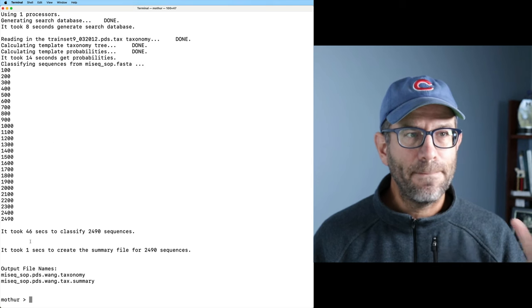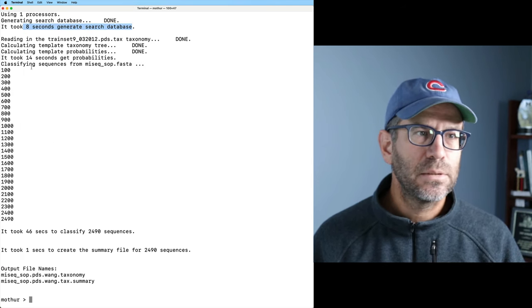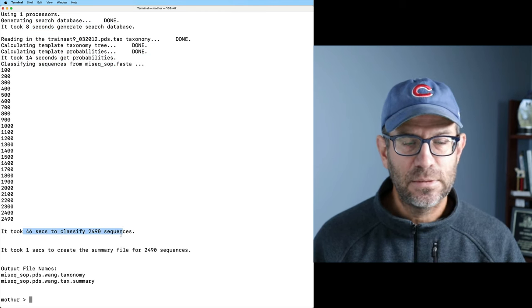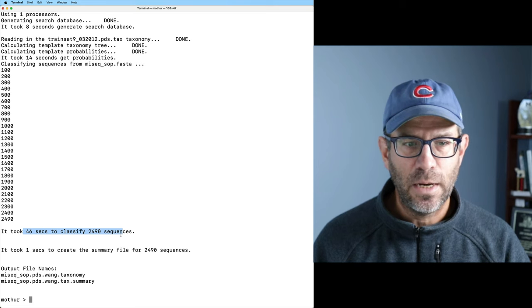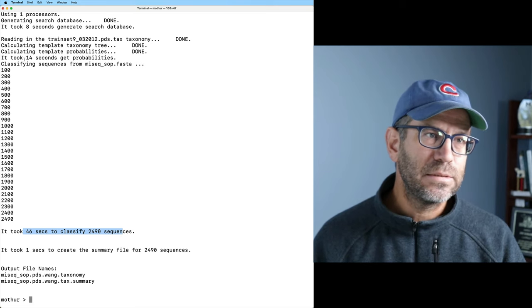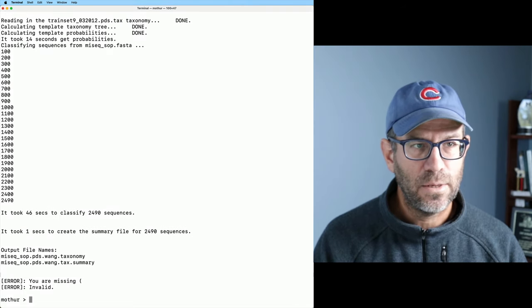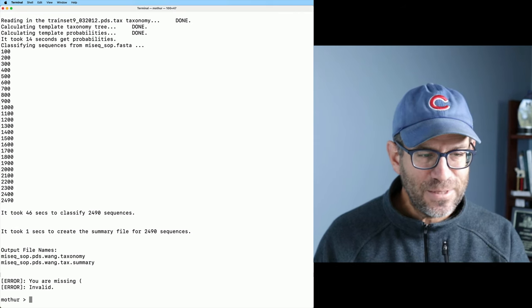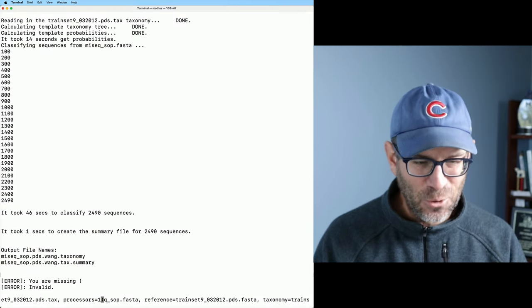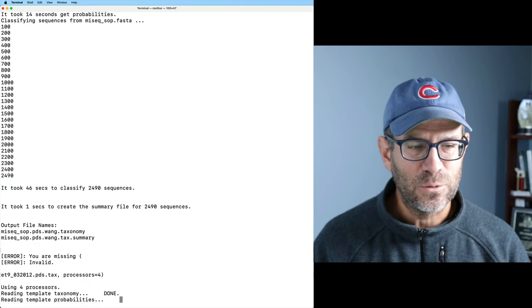So that took about a minute to run. It took 8 seconds to generate the search database, 14 seconds to generate the probabilities, and then another 46 seconds to classify those 2,490 sequences. So that is 68 seconds total. Let's run it again - I'll up-arrow and change processors equals one to processors equals four to see how long it takes with four processors.